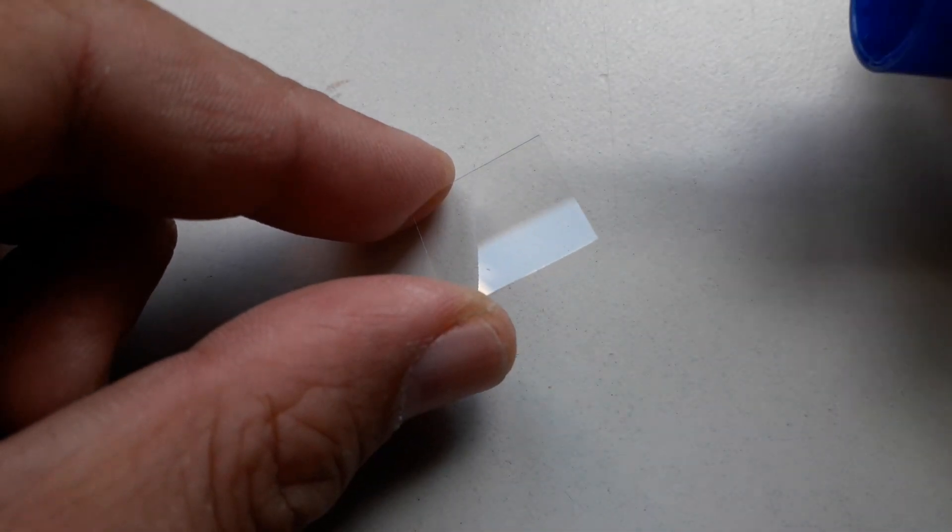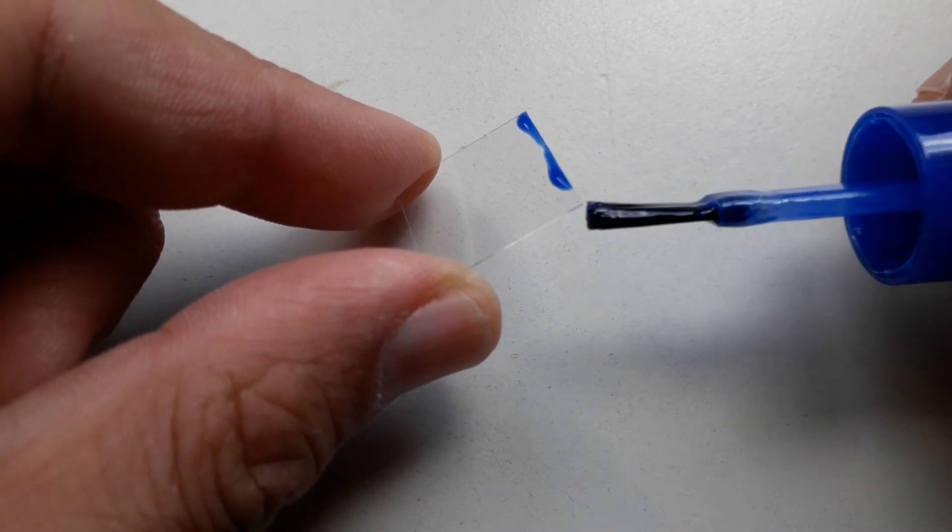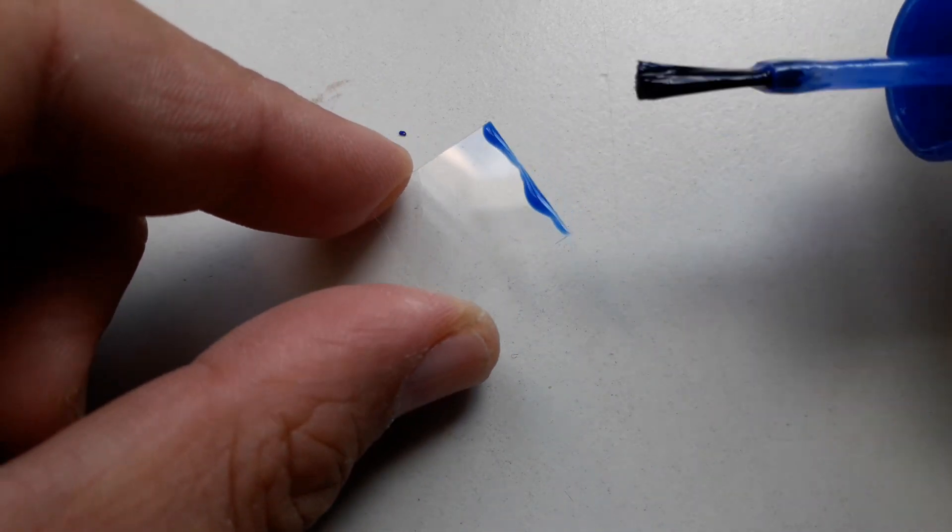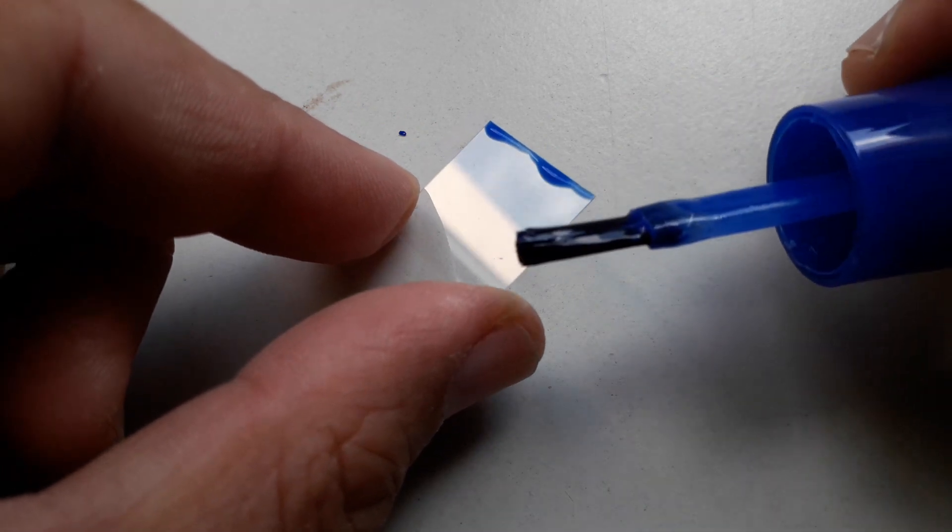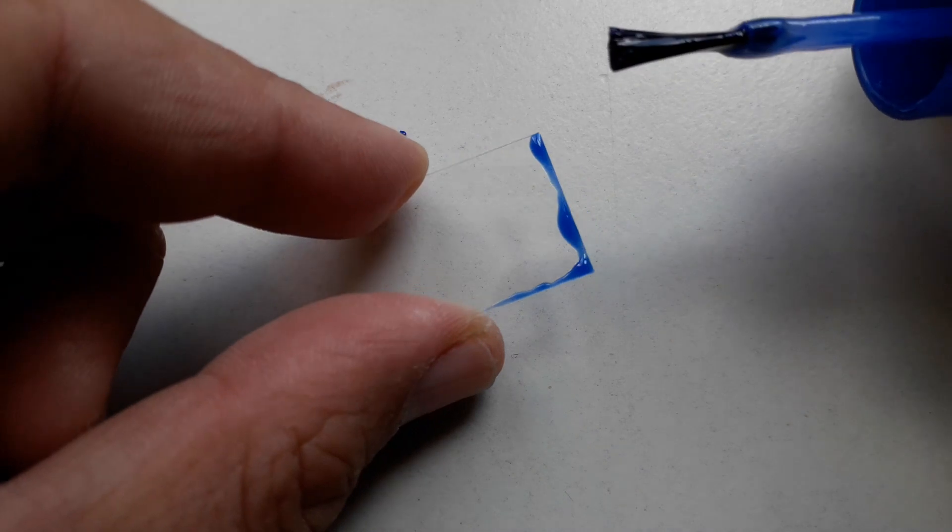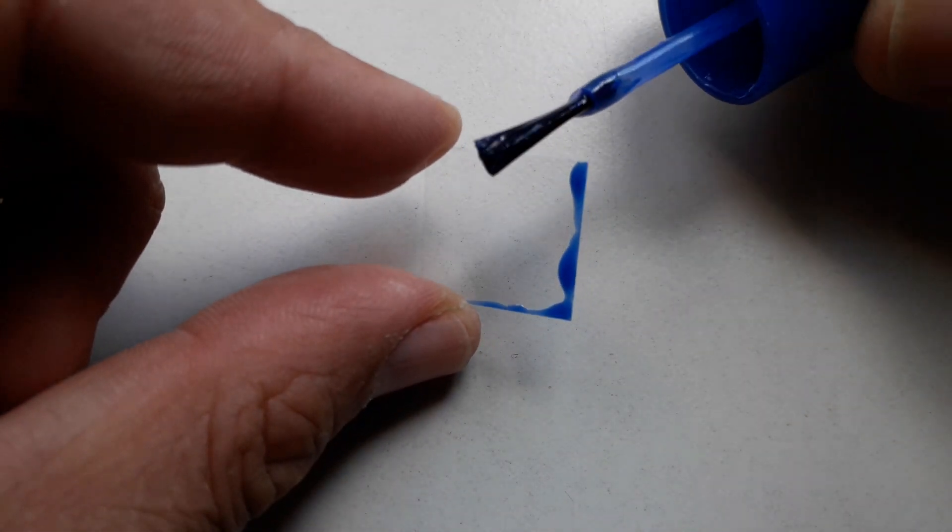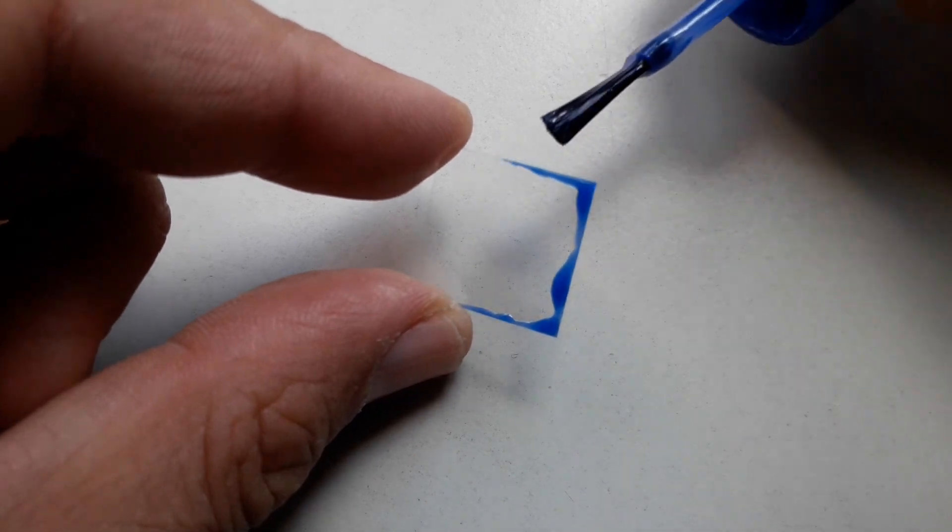What you do is you take a cover glass and you first cover the edges with nail polish very carefully just like this and you allow this to dry. This will now be both a spacer and it will also prevent the nail polish from reaching the specimen. This is probably the preferred method.